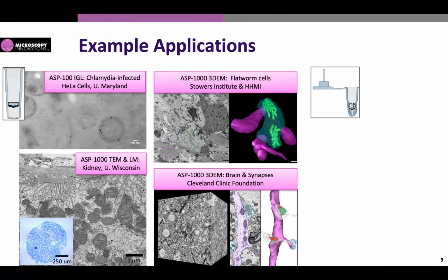These next two examples are serial block face, three-dimensional electron microscope imaging.